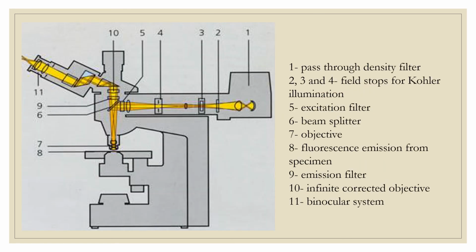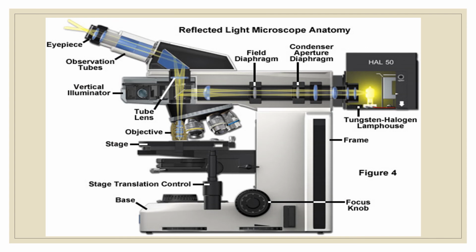Here's a diagram of an incident light fluorescent microscope, and I'm just going to leave this slide up for a second for you to look at. And then here's another picture of a fluorescent microscope, and it outlines the different parts of the fluorescent microscope. So I'll give you a few minutes to look at this.